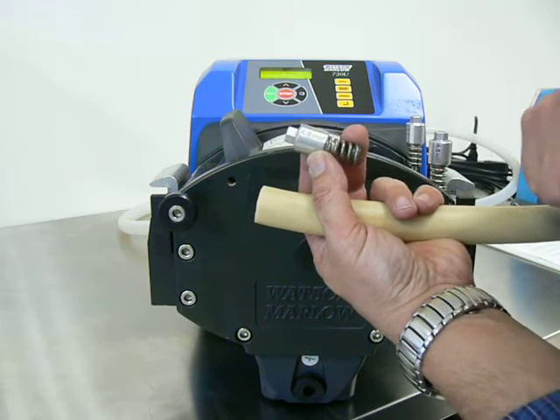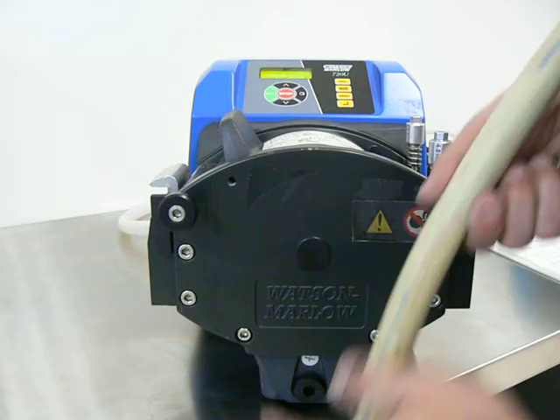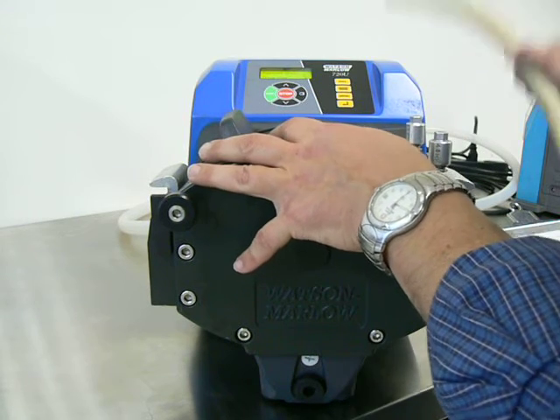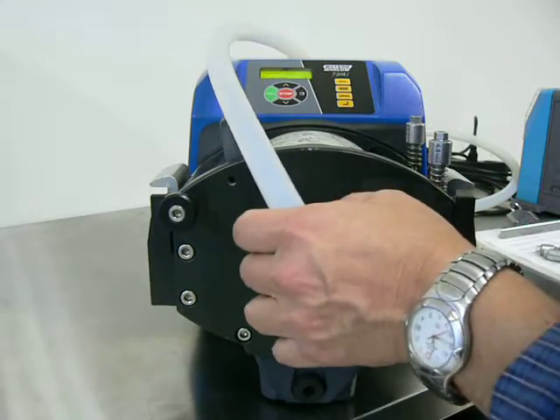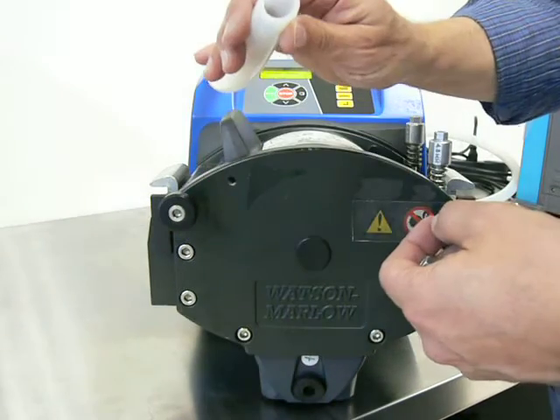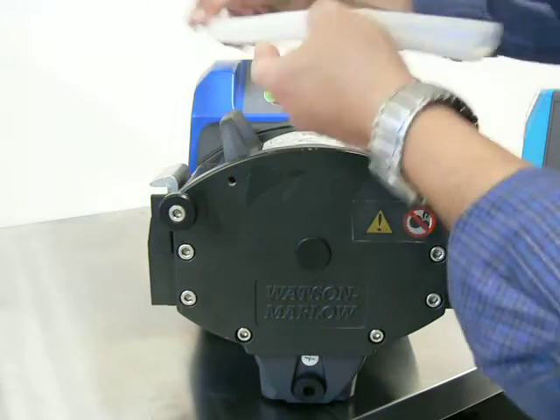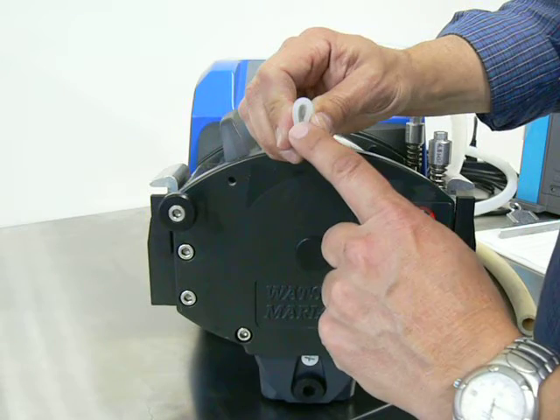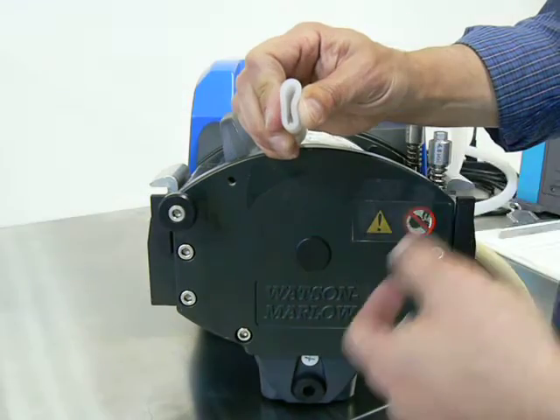4.8mm wall thickness tubing is not very common. Oftentimes operators will see this pump and grab a more common tubing, which is the 3.2mm wall thickness tubing. An issue can happen when you try to run 3.2mm wall thickness tubing in a head designed for 4.8mm. Because this is a smaller distance than the pump is designed for, you will either get the tubing walking through the head when you operate the pump, or you'll get very little flow or no flow.